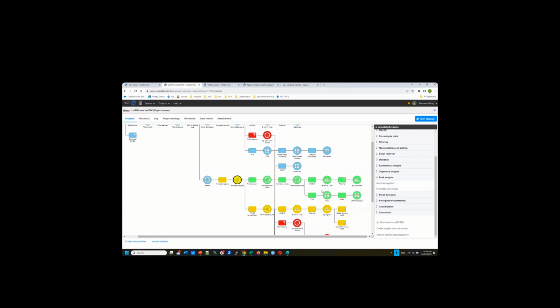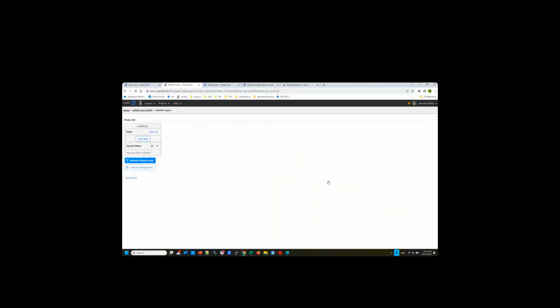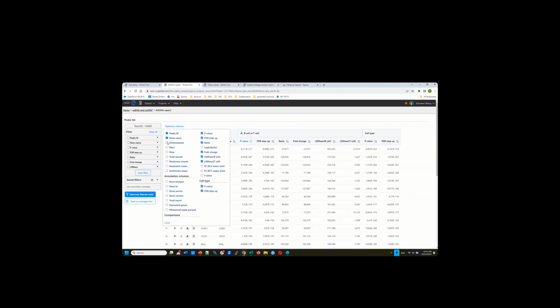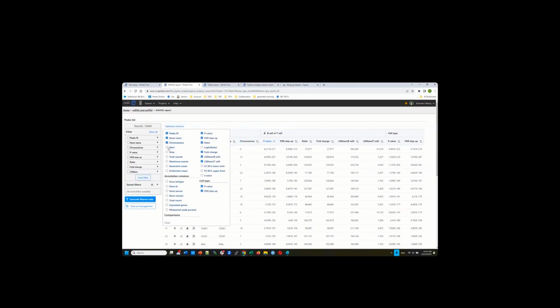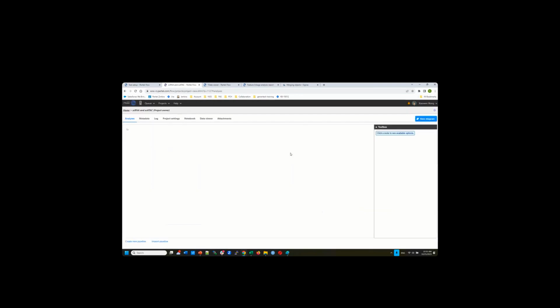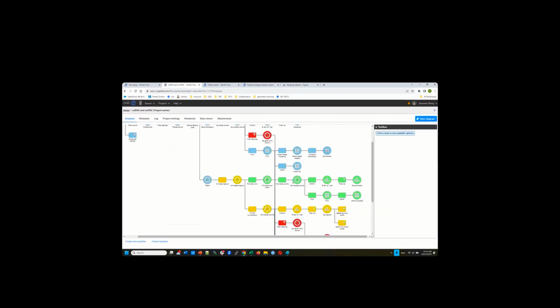You can also perform differential analysis once your cell types are identified. Even though I call this a gene, you will remember this is actually a promoter region. We call it the gene location, but remember this is a promoter region difference. Okay, this is one way to look at the data.